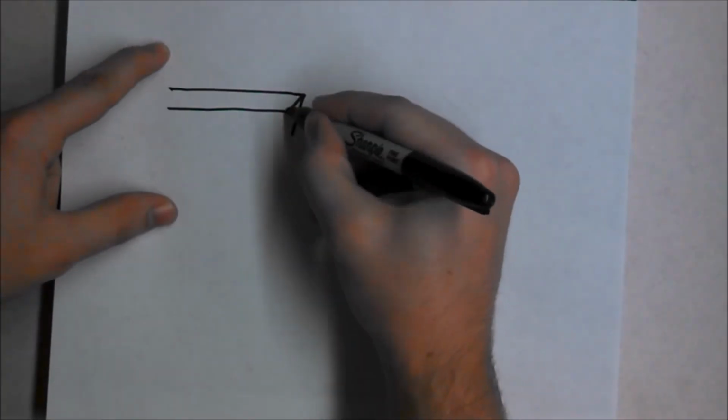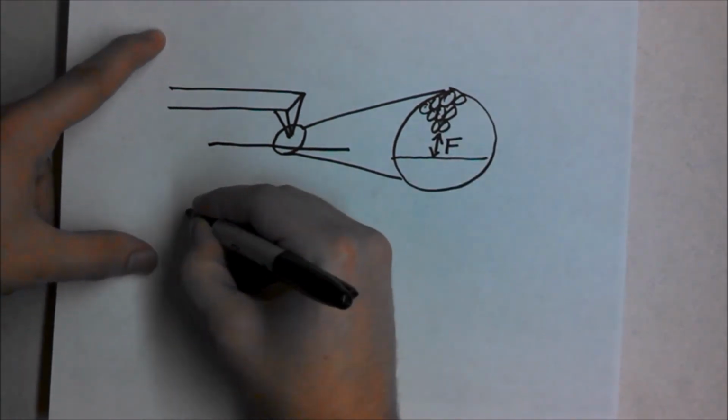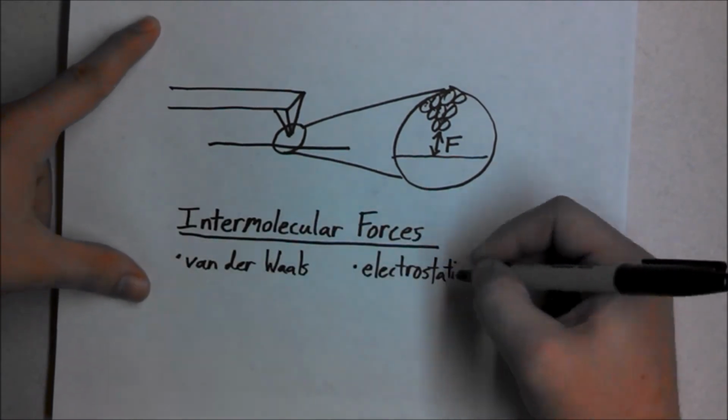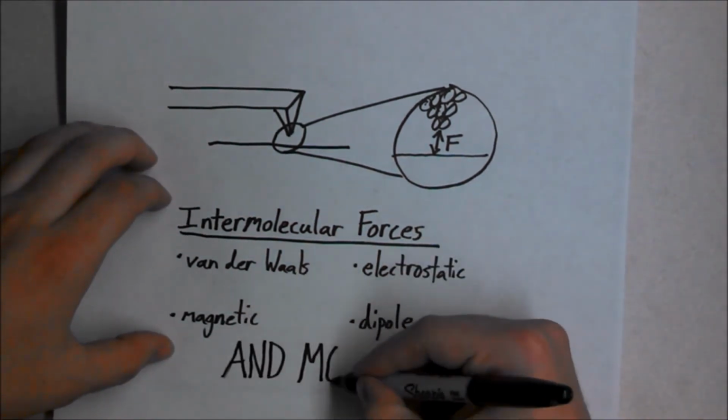It's important to note that the cantilever never actually touches the surface of the sample. It just comes close enough that the repulsive forces push the tip away. And these forces are totally dependent on the chemical makeup of the sample you're measuring, so you have to review your chemistry before you make any conclusions about your measurements.